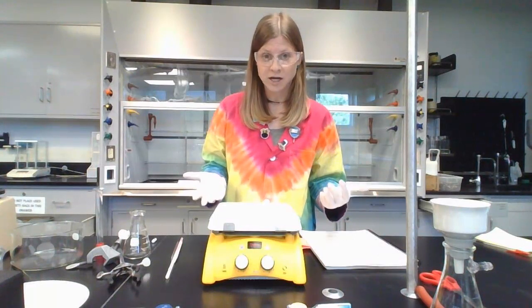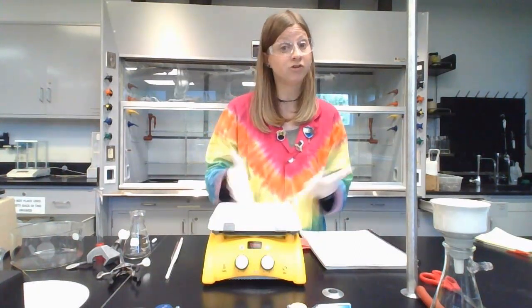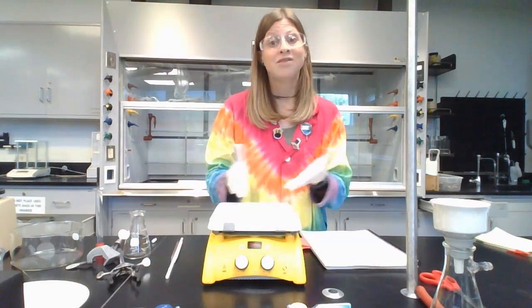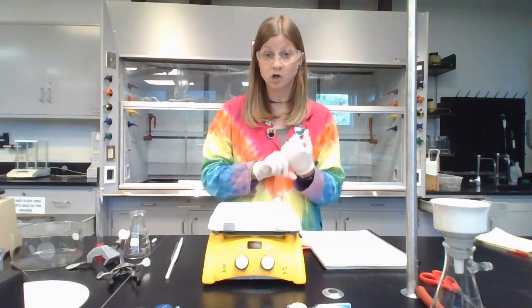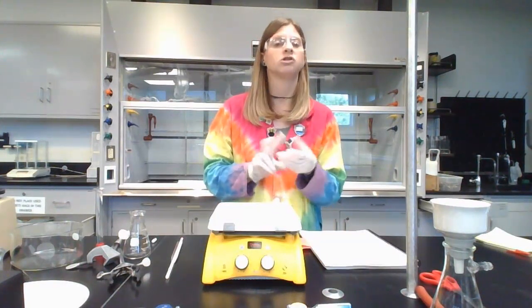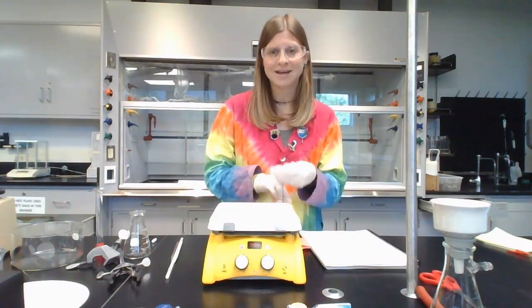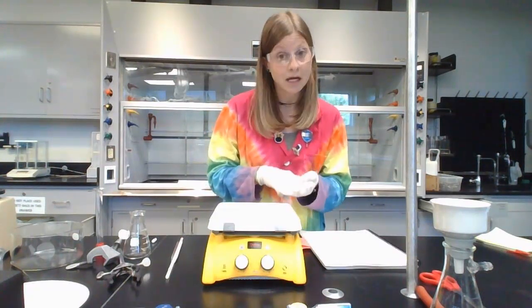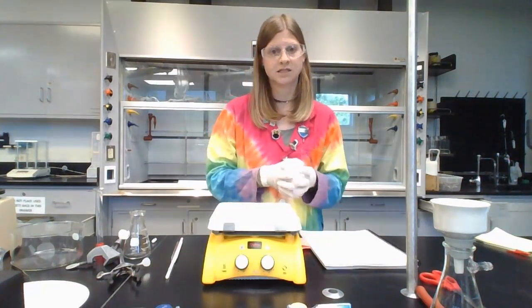So we do multiple tests. We're also going to do thin layer chromatography, which is something that you did in the very first lab, the chromatography lab, that we're repeating again. We're once again going to be comparing the three things: the starting material, salicylic acid, pure aspirin, acetylsalicylic acid, and the thing that you made. And then based on that, get some idea about what's happening.